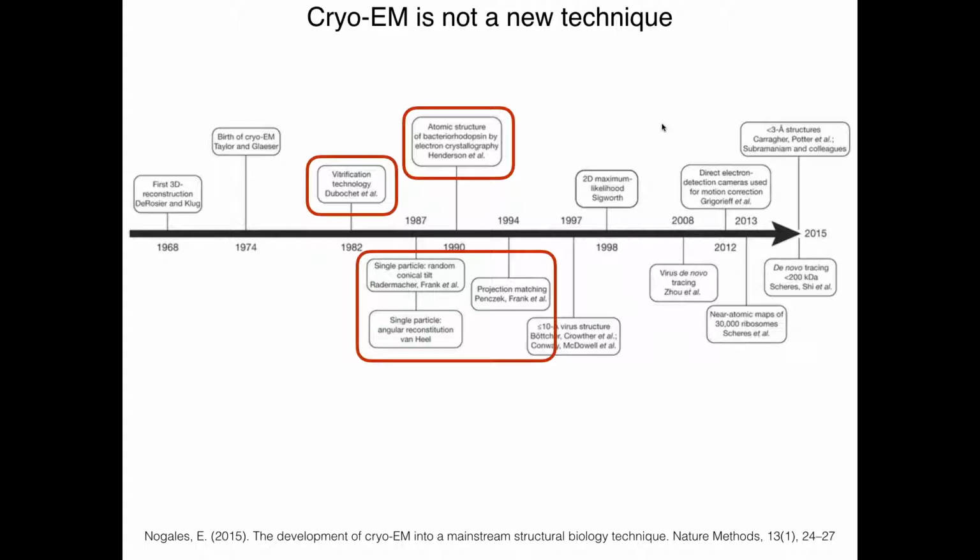So the first demonstration that you can use EM or cryo-EM to image protein molecules at near atomic resolution was really demonstrated by Richard Henderson in 1976 with a reconstruction of purple membrane protein, bacterial rhodopsin, using electron crystallography. So not single particle analysis, but electron crystallography. And then about 15 years later, he derived a near atomic resolution structure of bacterial rhodopsin using improved methods.